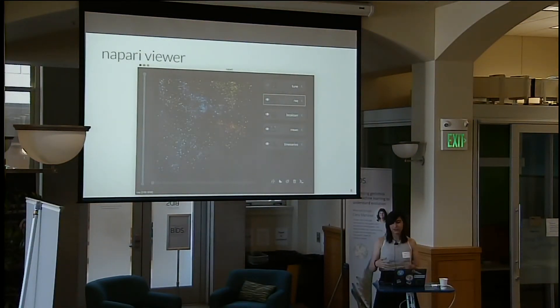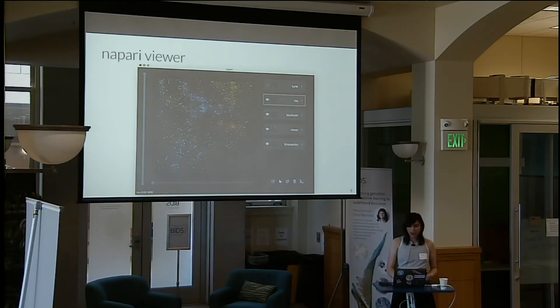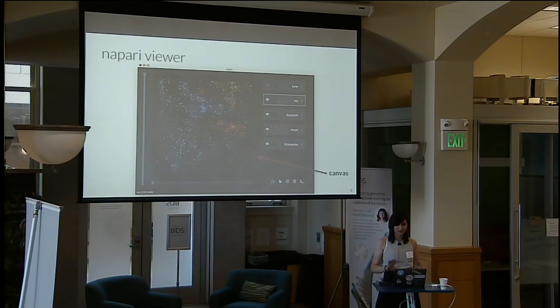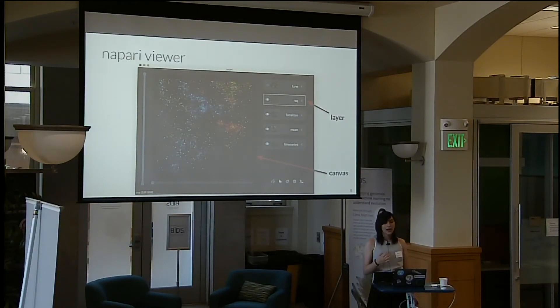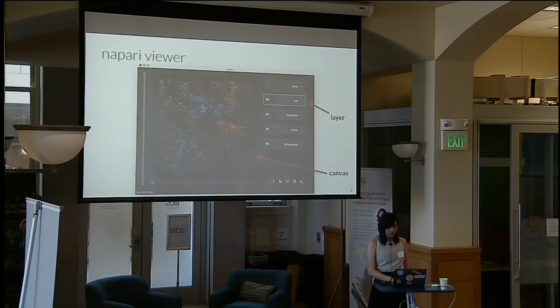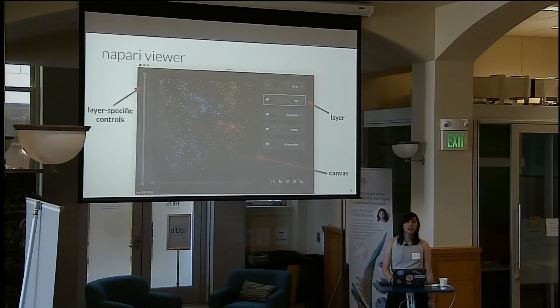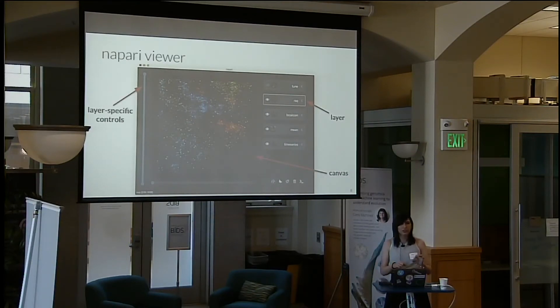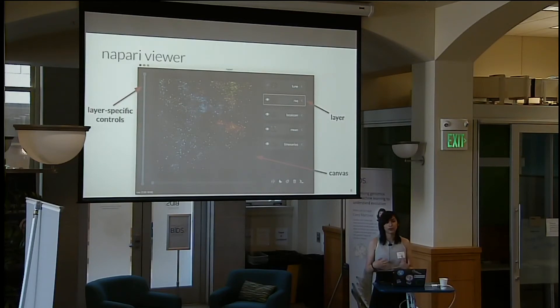Getting into NAPARI, this is what it looks like. It's centered around the viewer, which consists of a few different parts. We have the canvas where all of your data is going to be displayed — you can pan and zoom interactively with it. We use the concept of layers, similar to Photoshop, and for each layer type it corresponds to a different data type. For example, you might have an image layer or a layer for annotating regions. Over here we have the layer-specific controls, which are dependent on what layer you have selected. Right now we have an image layer selected, so these are the brightness and contrast limits. If you were to select a region type of layer it could be a paintbrush and eraser tool.